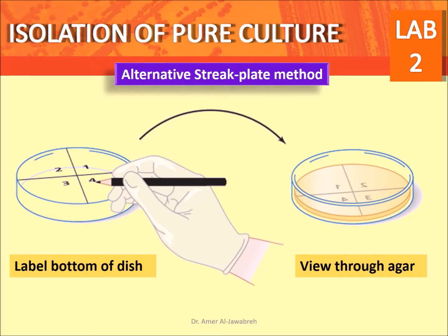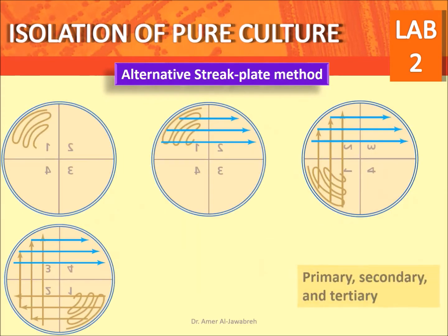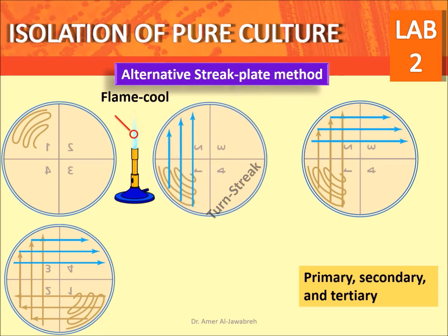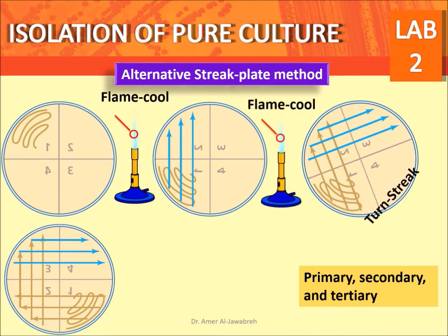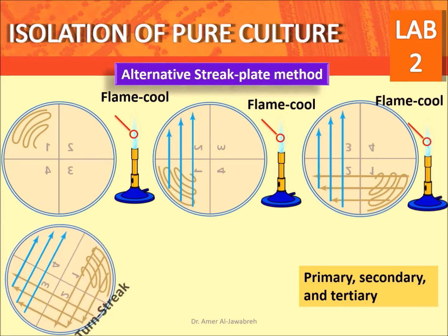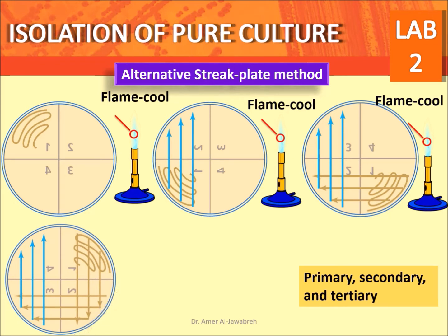Alternative streak plate method. Label the bottom of the dish. View through the agar. The alternative streak plate method includes three rounds of streaking: primary, secondary, and tertiary. Streak. Flame, cool. Turn, streak. Flame, cool. Turn, streak. Flame, cool. Turn, streak. And finally, flame, cool.